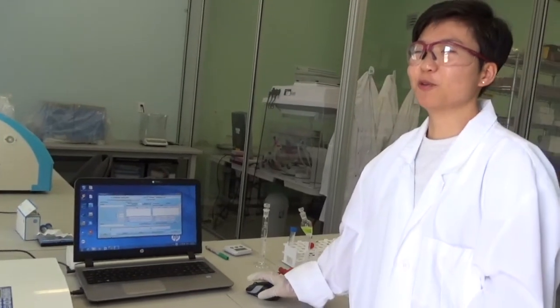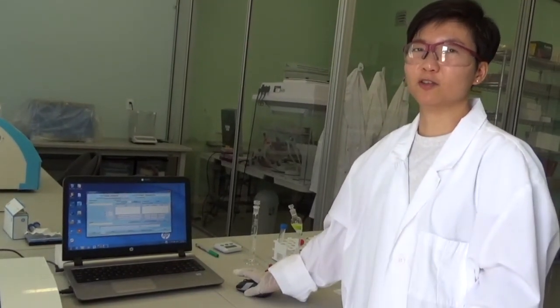Yeah, this is how you can measure anionic surfactant in an aqueous solution.